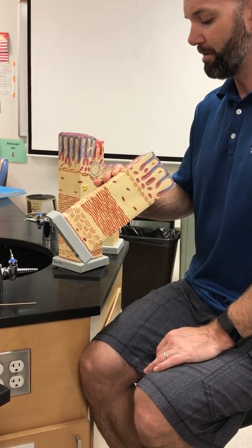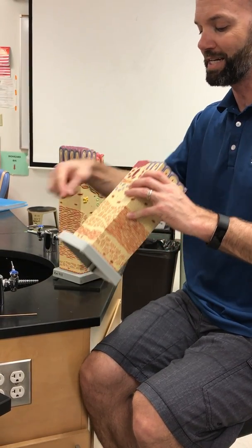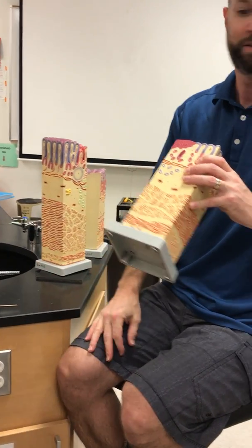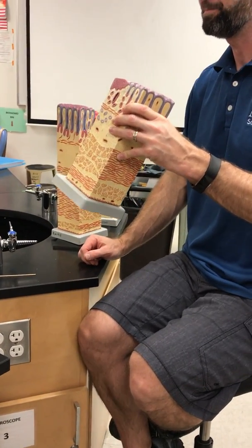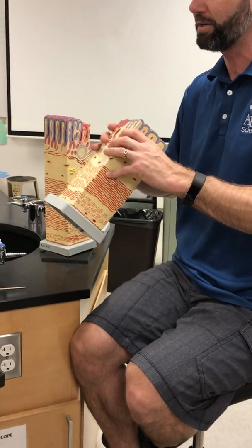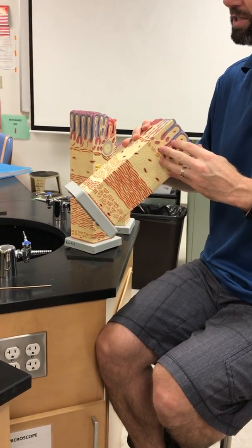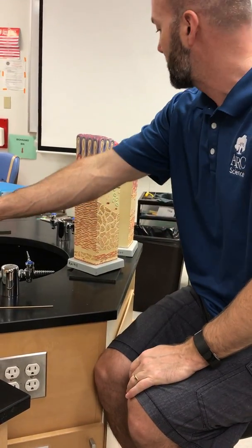And then what would the stomach have that the esophagus would not? And I'm thinking down here. But the whole thing has serosa, because again, we're at the transition point. So a little further up the esophagus, serosa will disappear. A little further down into the stomach, and the oblique layer will appear. We're just not there yet.